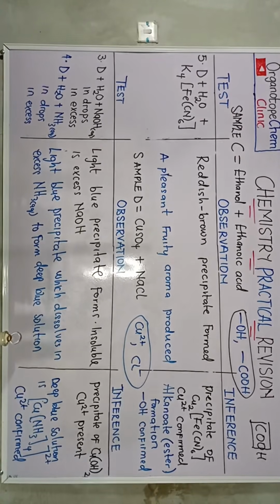I believe I've been able to distinguish the acid used perfectly to you. You are expected to use HNO3, but in the practical guide sent to us, it is hydrochloric acid that we have.